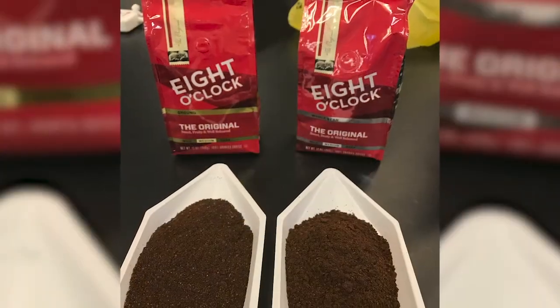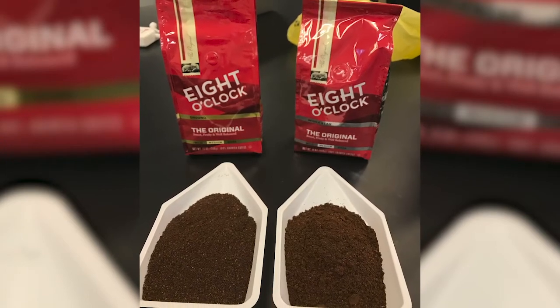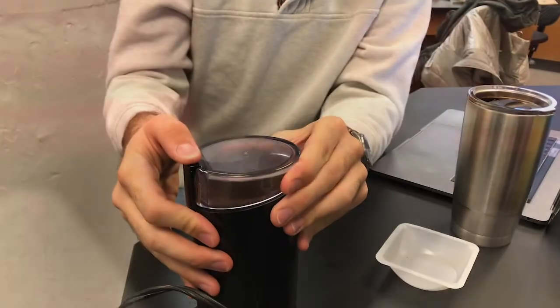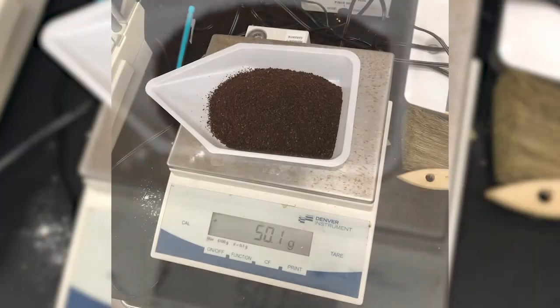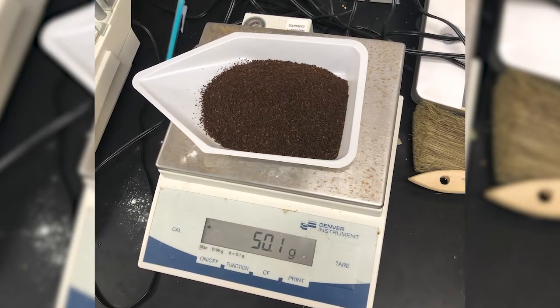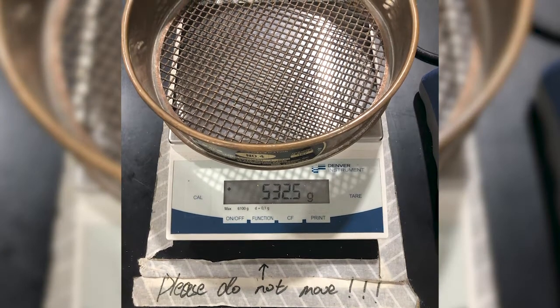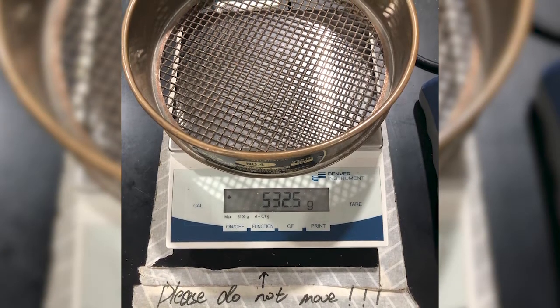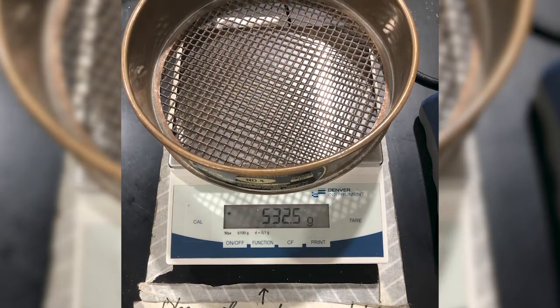So the first step in our procedure was to grind the unground coffee beans. We borrowed a coffee grinder from the graduate office. We then measured out 50 grams of each type of the different coffee grounds, both the pre-ground and the coffee we ground ourselves. After we got to the sieve machine, we took an initial mass of each sieve and made sure that they were completely clean of other materials that were previously used in the machine.